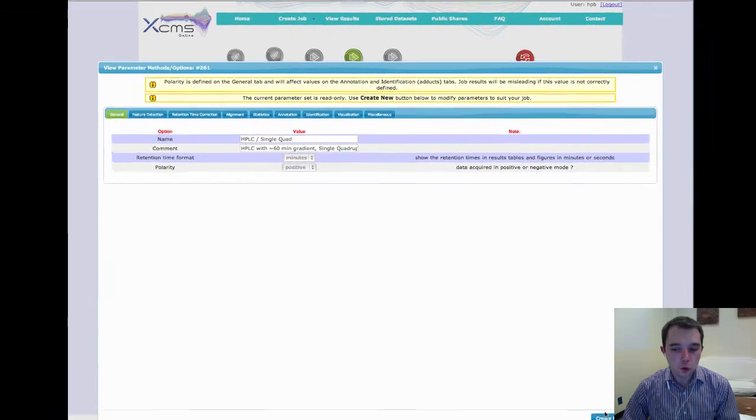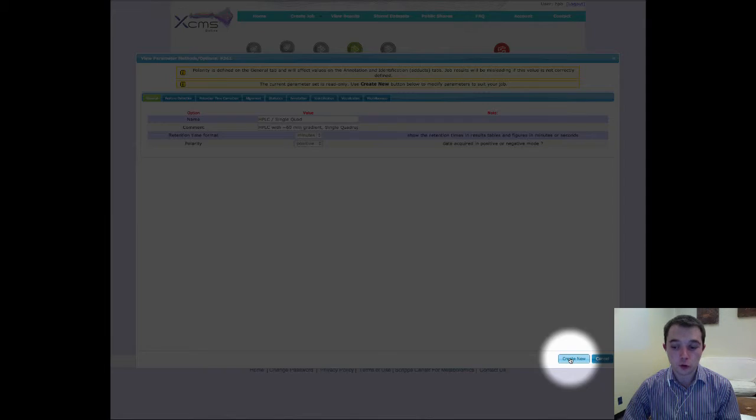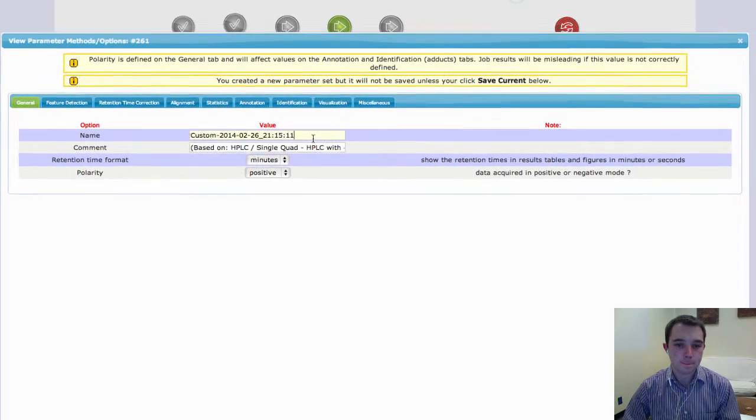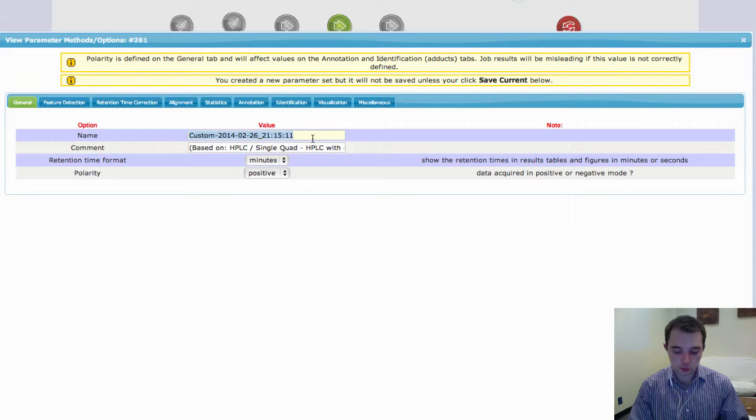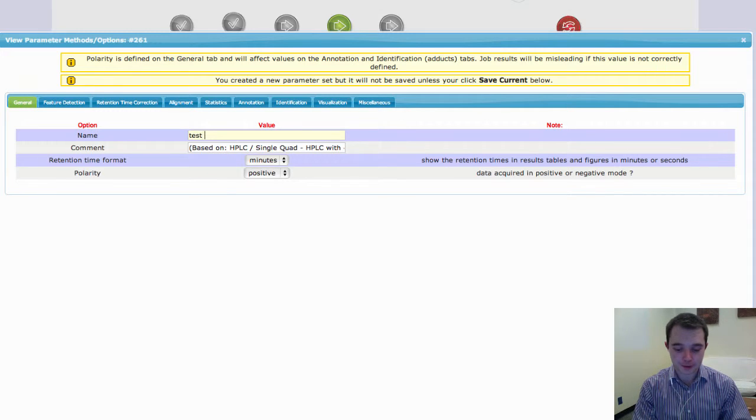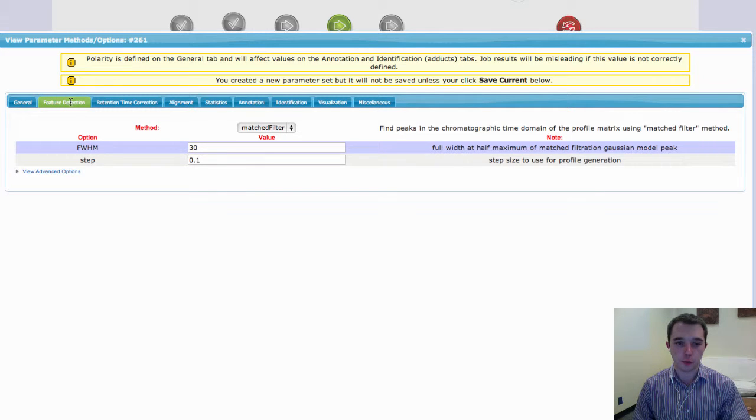If you want to create new parameter settings, you can click on New, rename it to what you want, probably something a little bit better than Test, and then go through all of your different parameter settings.